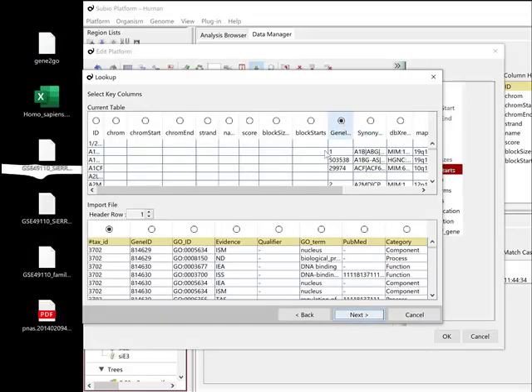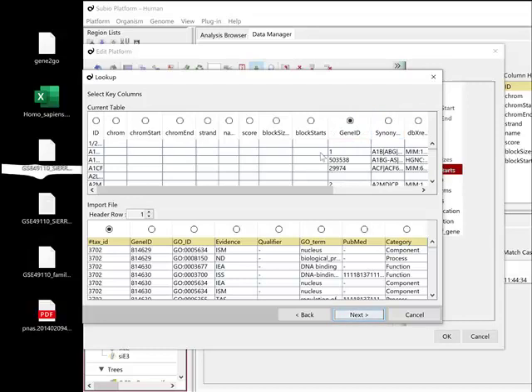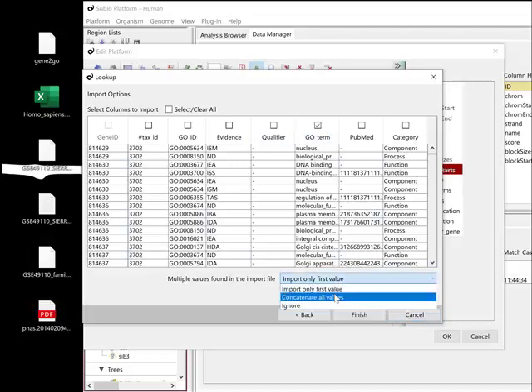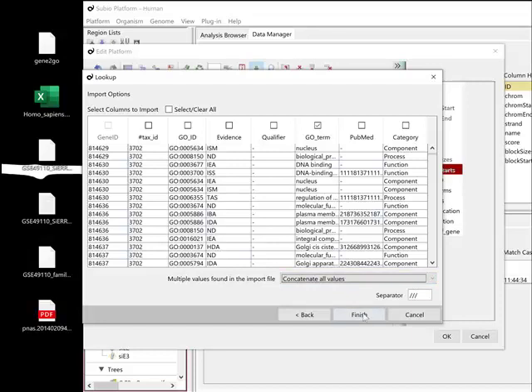Gene ontology information from the Gene2Go file. Make sure you use the Concatenate All Values option this time.